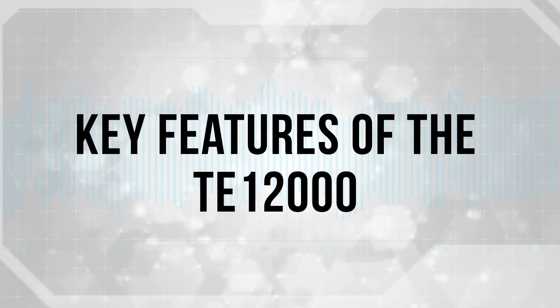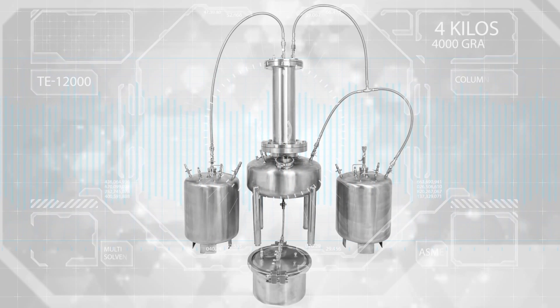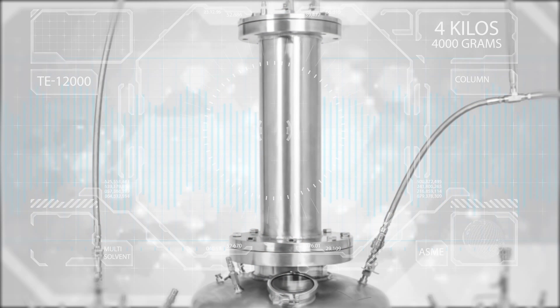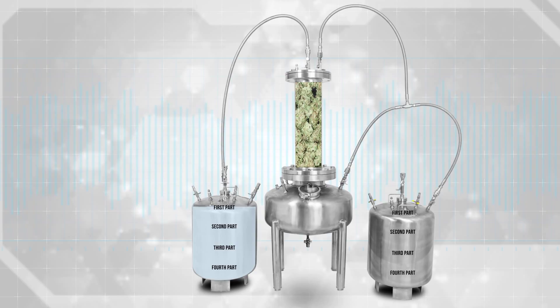Key features of the TE12000 extractor. This TE12000 titanium extractor can hold 4 kilos of plant material and extract as fast as 5 minutes using a temperature range from as low or high as your supplied chiller heater can go. Common temperature range, negative 40 Fahrenheit to 120 Fahrenheit.